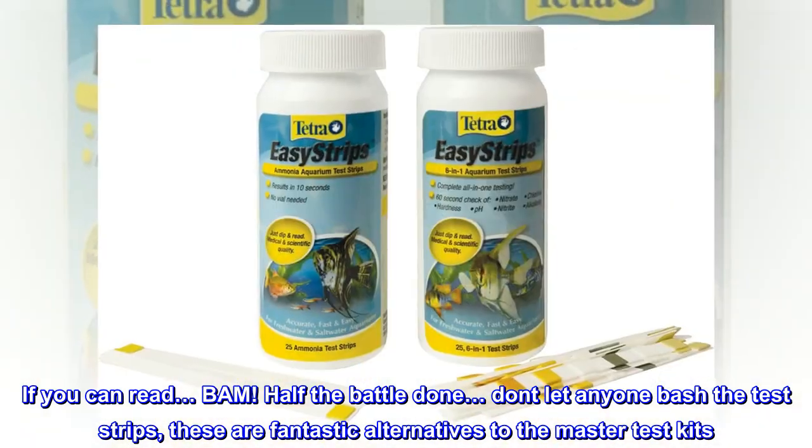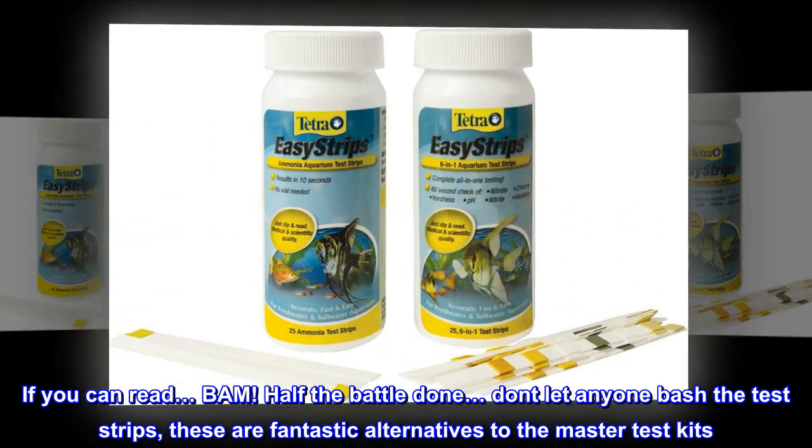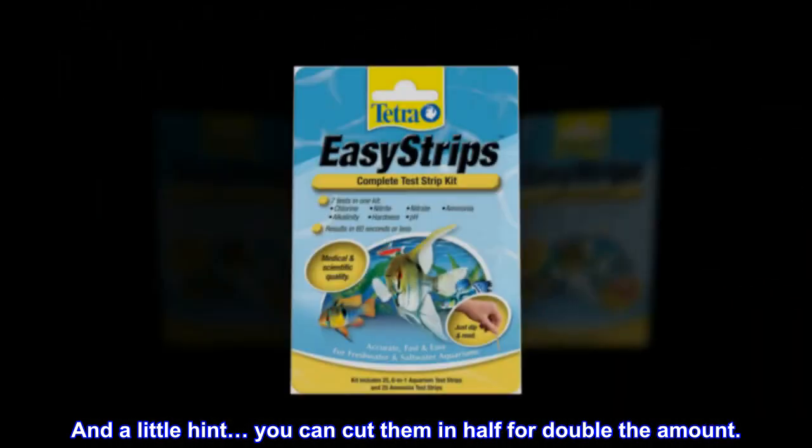Don't let anyone bash the test strips. These are fantastic alternatives to the master test kits. And a little hint — you can cut them in half for double the amount.